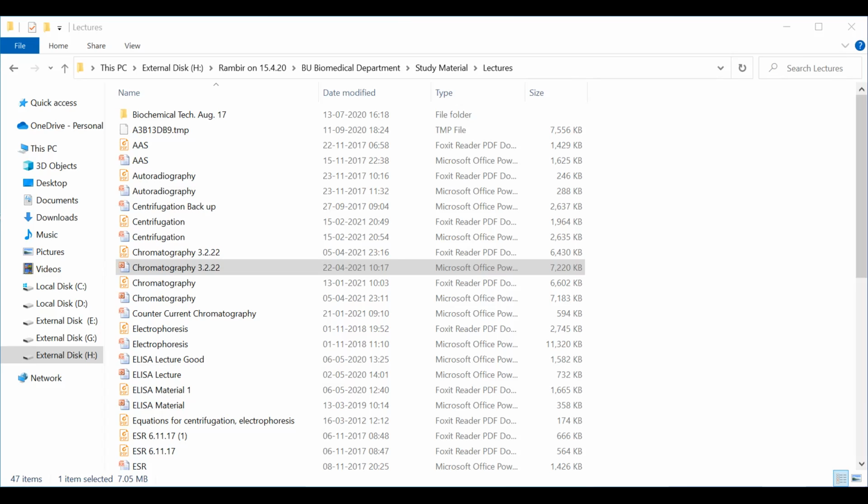So when we say adsorption chromatography, that means the stationary phase particle is solid. It is solid from inside. Okay, sir. That means the stationary phase is always what kind of nature? It is always solid. We discussed now which two states of matter can be stationary phase. The liquid and the solid one. Very good. So in adsorption, what will be the nature of the stationary phase? The solid phase. It's always solid. Very good. You should remember it.